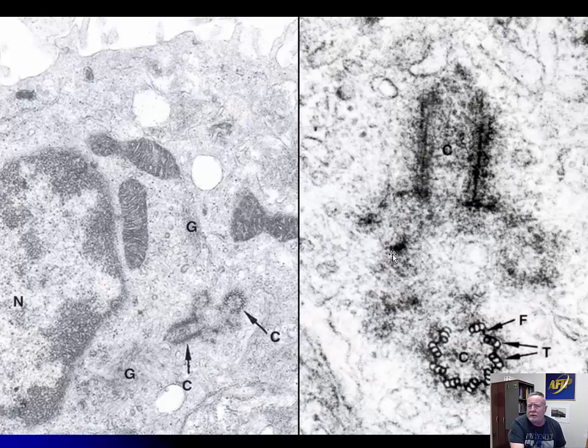And a very similar structure appears only close to mitosis in the cells. This is the mitotic spindle, or the base of the mitotic spindle, or the centriole. It actually, to me, looks like a little turtle, or maybe a beaver, if this is the head and this is the tail, and it always appears right before mitosis in the area of the nucleus.